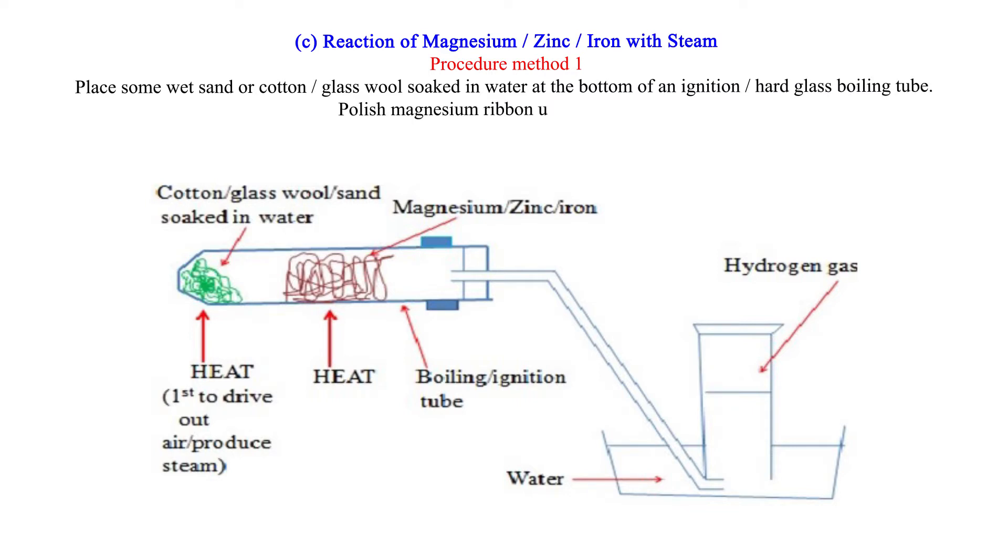Polish magnesium ribbon using sandpaper. Coil it at the center of the ignition or hard glass boiling tube. Set up the apparatus as below.